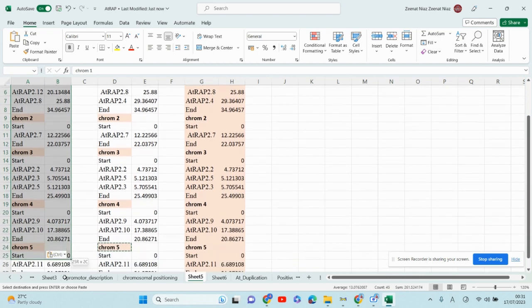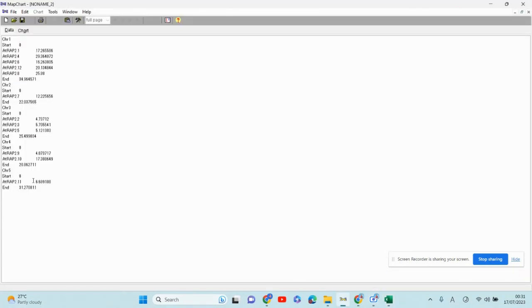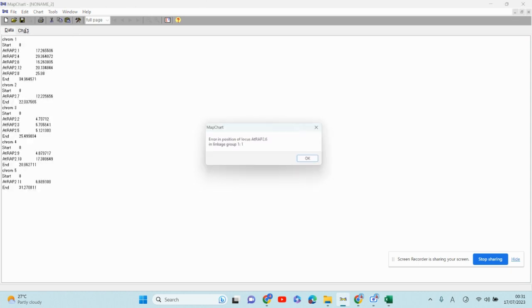So when I copy this and paste it again in the software, then there will be the error.